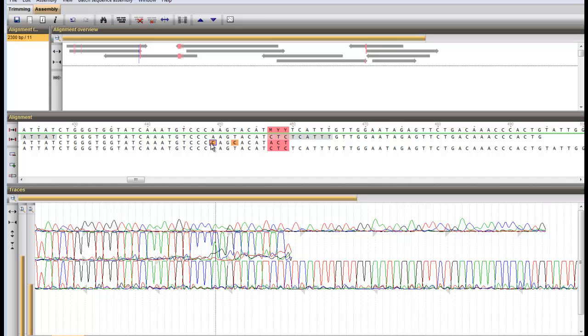The order of appearance of the trace files can be changed by clicking on a trace and using the page up, page down keys or the corresponding arrow buttons.